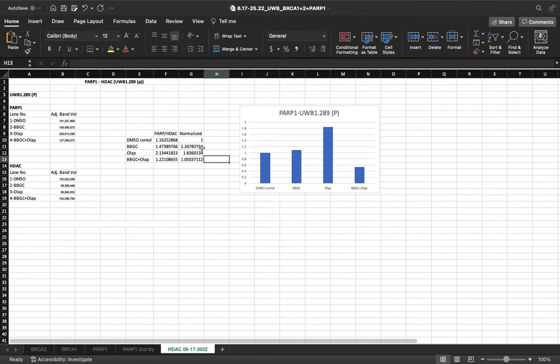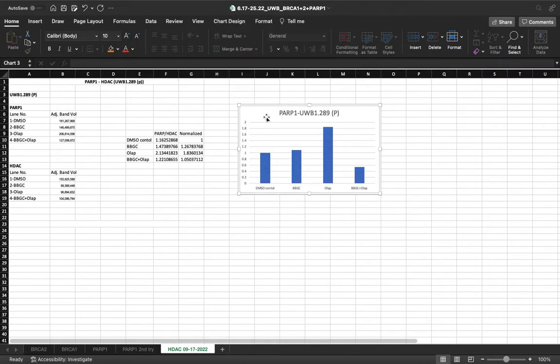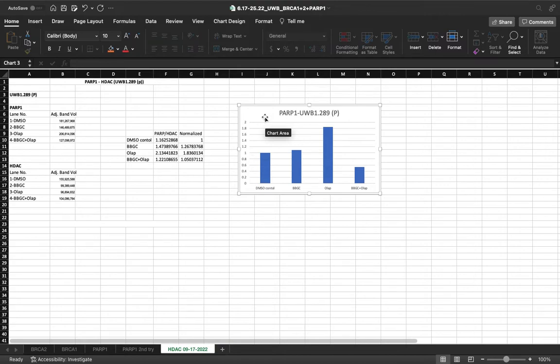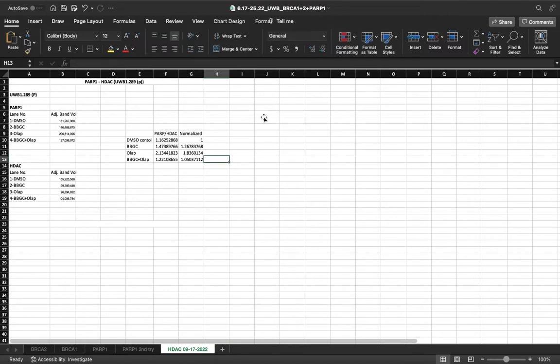Now that our data is corrected, we create a graph. For the purposes of this video, I'll delete this, and I'll show you how we make our graph.